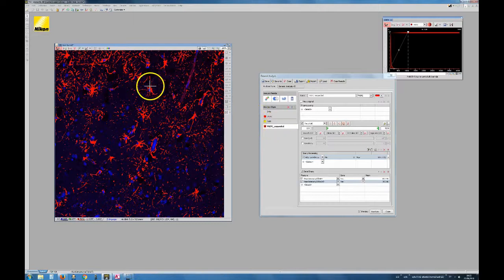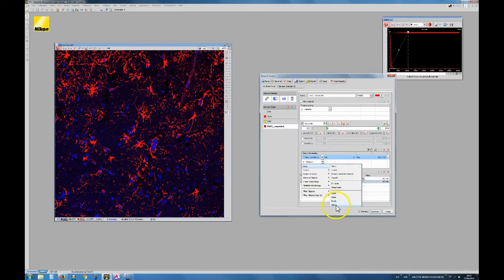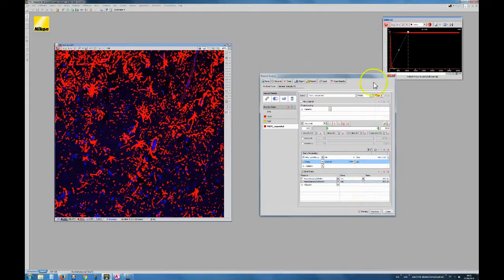And for this I'm going to increase the mask and make it a bit bigger, a few pixels bigger, so that the mask expands over the nucleus. And then I'm going to only get the astrocytes that have a nucleus. So here we go. Everything is the same, so I keep it the way it is here. But in here, I'm going to add a basic dilate function, which allows me to grow my mask.